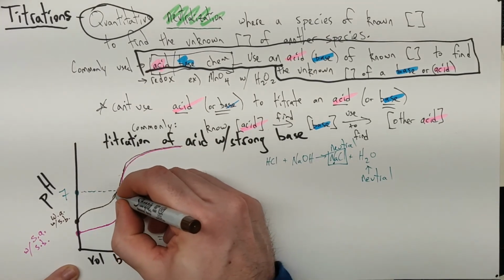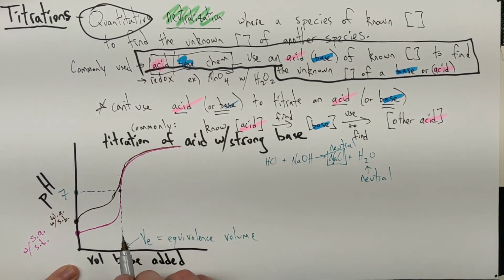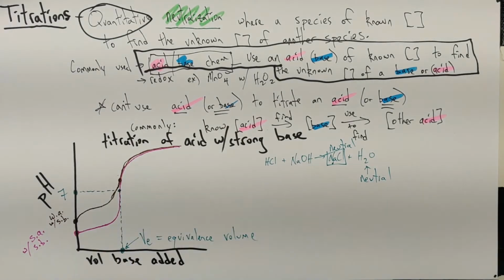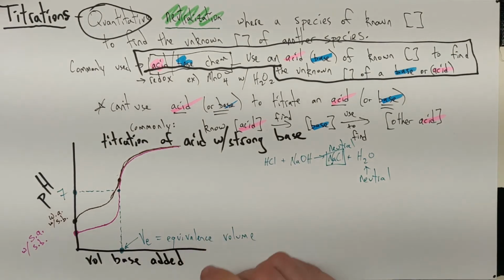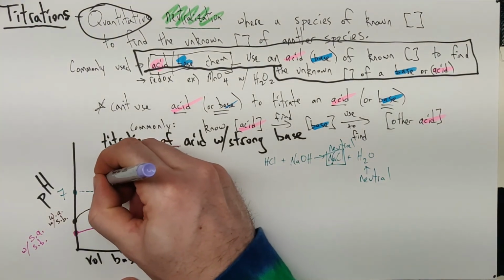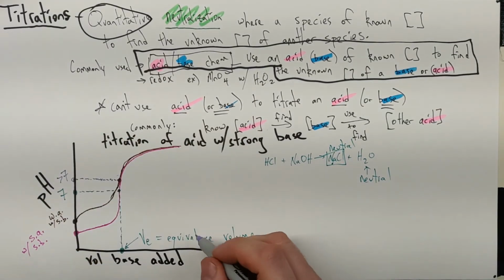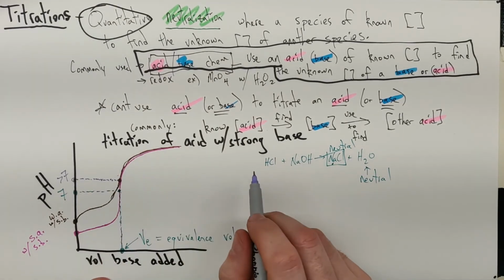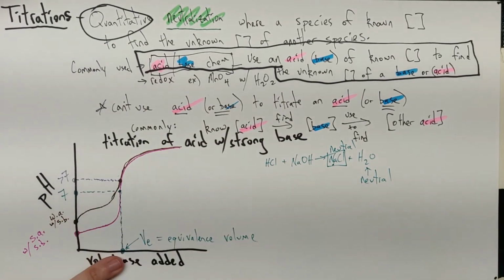So it does that, and then it's going to jump up and pretty much follow that. It's not the prettiest titration curve, but what I'm going to say here is that after our equivalence point, it pretty much follows that same behavior. And we've got some numbers to back that up. What you'll note first is that this equivalence point right here does not match the pH of our other equivalence point. The volume is going to be the same, but the location is a little different. So if I follow this over here, this pH is going to be greater than 7. And there's a specific reason for that. This isn't the straightest line. And our equivalence point volume here, assuming we started with the same volume and the same concentration of our weak acid, is going to be the same. But we do get that pH greater than 7.